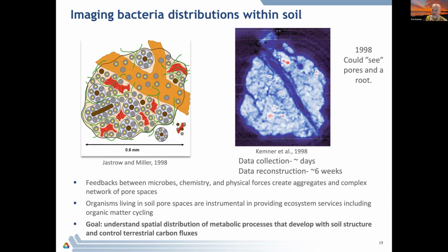But to put in perspective what happened in '98, this approximately 1 millimeter soil aggregate that was imaged took 3 to 4 days of data collection in full field tomography imaging. You can see a plant root that was actually running through this soil aggregate. And the data reconstruction took 6 weeks on a computer at the time.